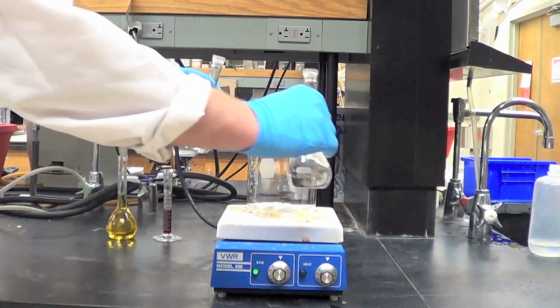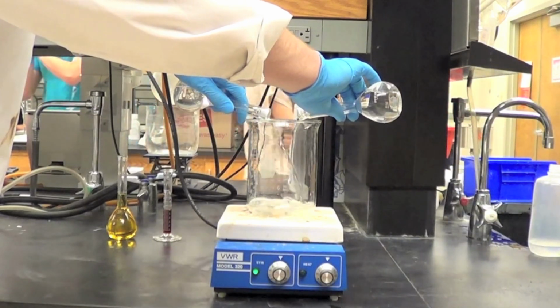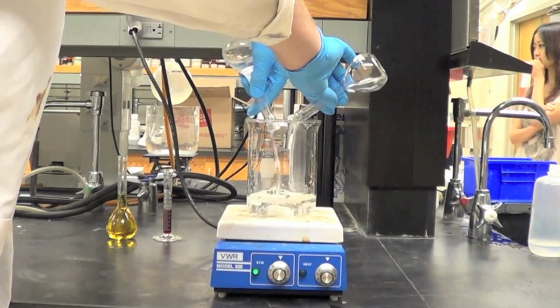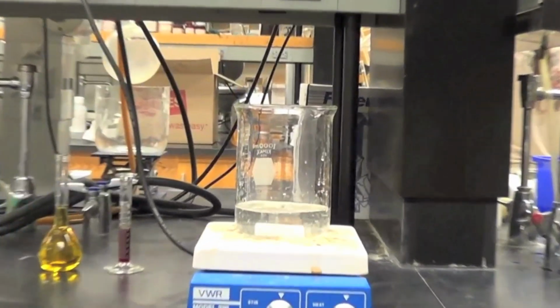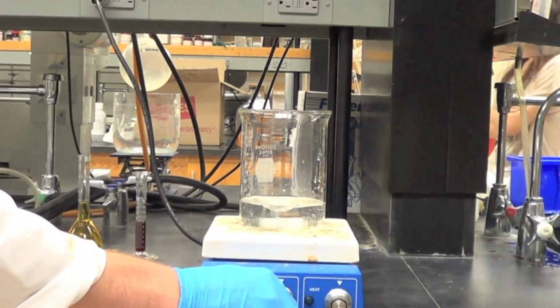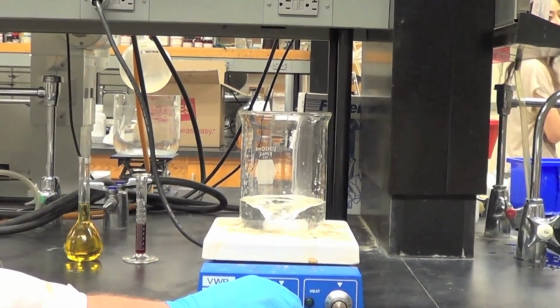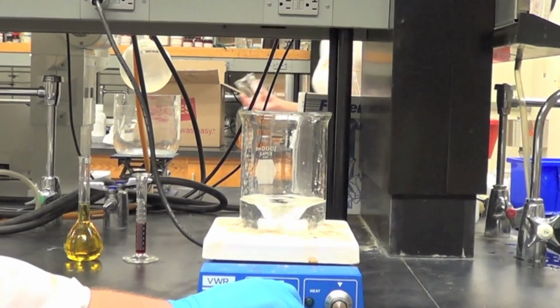Solutions A and B are mixed together in a magnetic stirrer. Normally it would now develop an amber color indicating the presence of elemental bromine. This did not happen, likely because of the undissolved potassium bromate. My thought was that it would dissolve in the mixed solution, and while this never happens completely, the oscillation still occurred. Alternatively, you could heat up the potassium bromate solution until it all dissolves and then begin mixing.